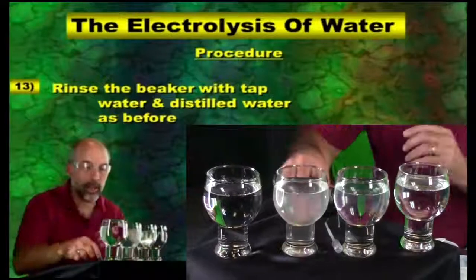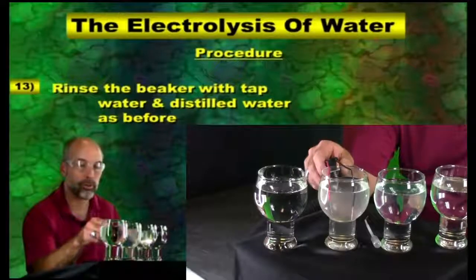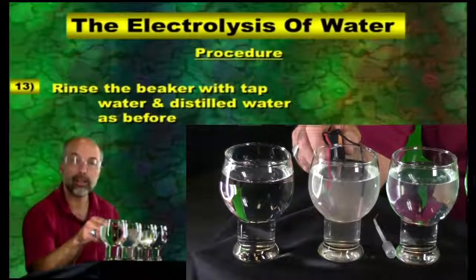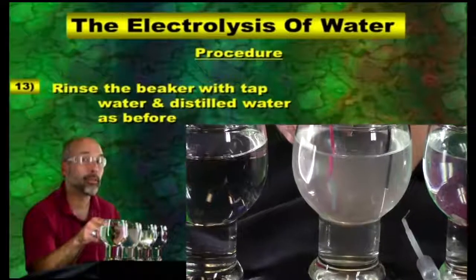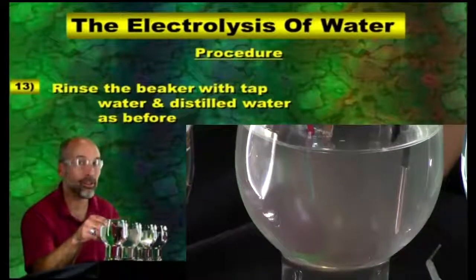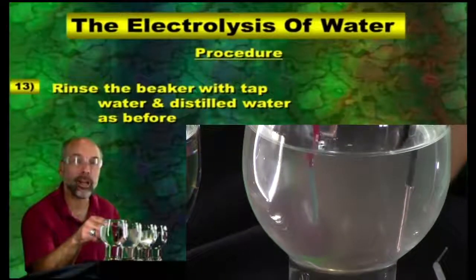Now let's see whether or not we see anything happening here. We're going to set it in, and we're going to look for bubbles. So we'll put it up against the side. I'm just not seeing anything. Wow, that's exactly what I would have predicted. I didn't even have to pull out my battery, or do the wires, or do anything. I could have just told you that. But it's always fun to do the experimental side of science also, just to make sure our predictions are accurate.